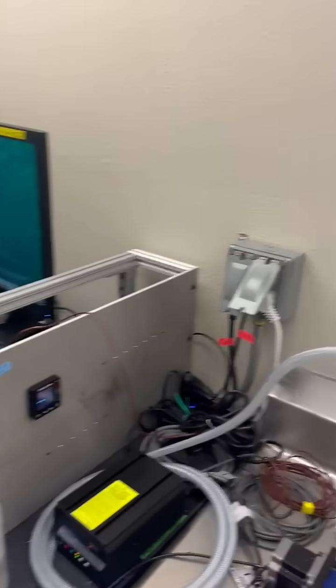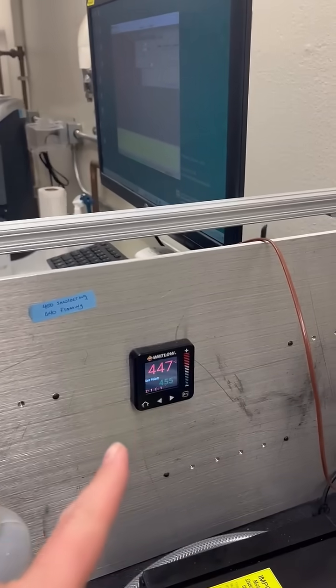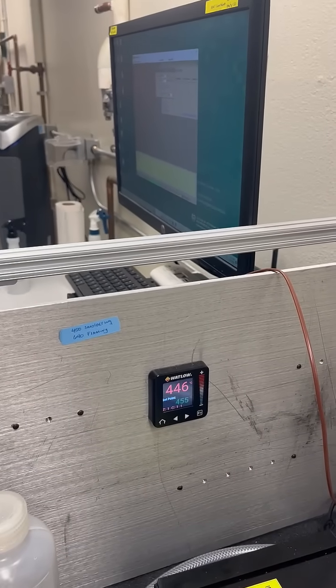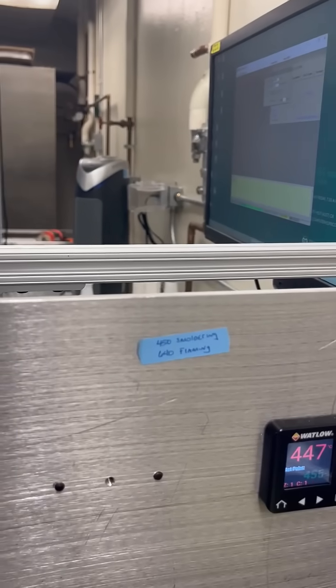Each day we come in and we plug in and turn on the furnace. This display here shows you the current temperature and the types of temperatures that we normally try to hit for both smoldering and flaming.